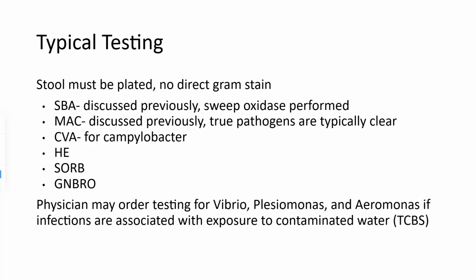MacConkey, again, I discussed that previously. True pathogens are typically clear, which means the ones that actually cause the majority of the infections are usually not lactose fermenters. CVA, HE, Sorb, and GNBRO, I'm going to talk a little bit more through the next few slides.